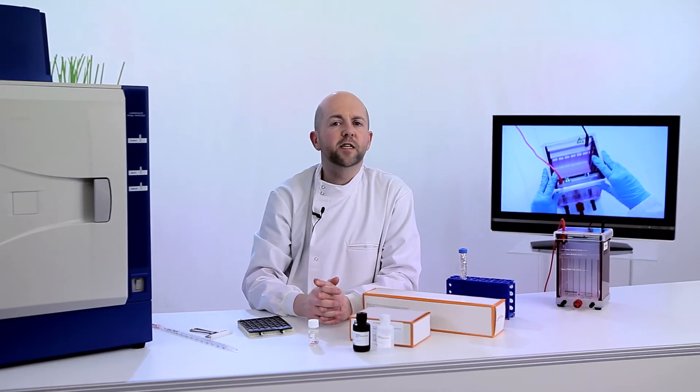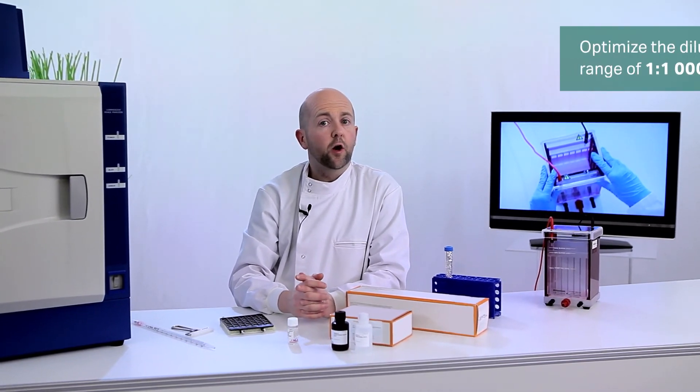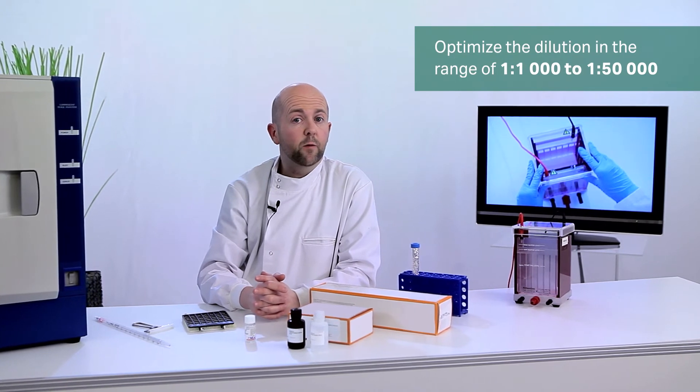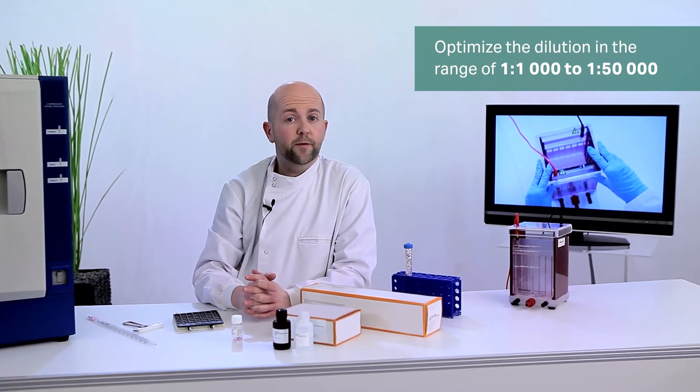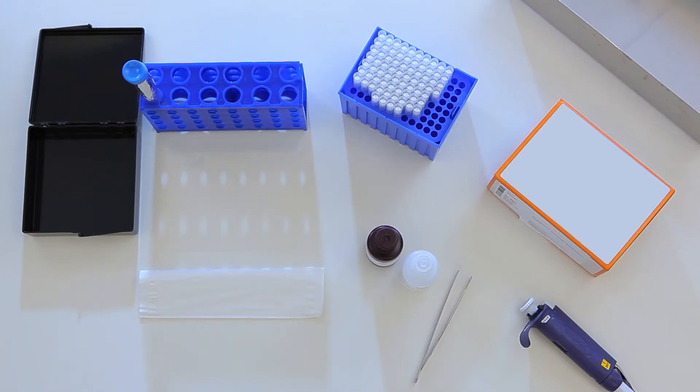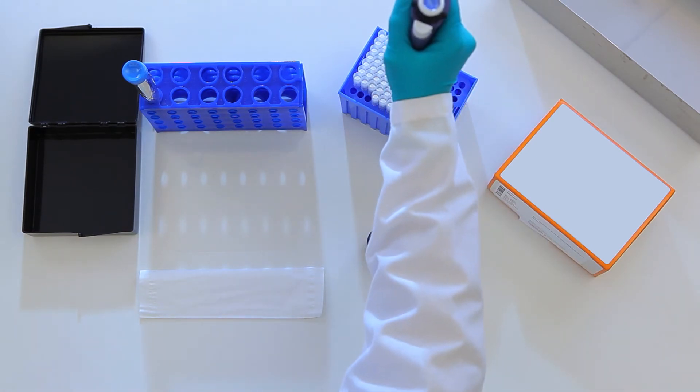Always select specific antibodies of high quality and optimize the dilution in the range of 1 to 1,000 to 1 to 50,000. ECL prime keeps precious primary antibody use to a minimum.